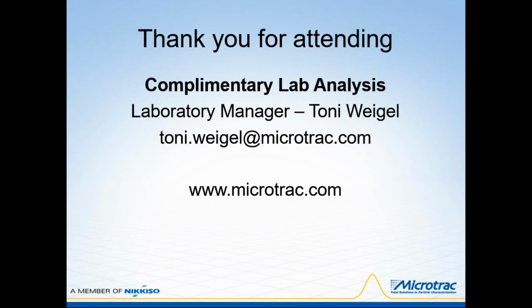Great. Okay, so actually the last question is two parts. Can suspensions be analyzed or only dry samples? Can your instrument for wet samples give concentrations? We have parameters that correlate with concentration, and the answer is yes. We have a wet system, and we have routines that correlate with concentration. So if you know the concentration of a material, you can run a few different concentrations and correlate that number to your concentration.